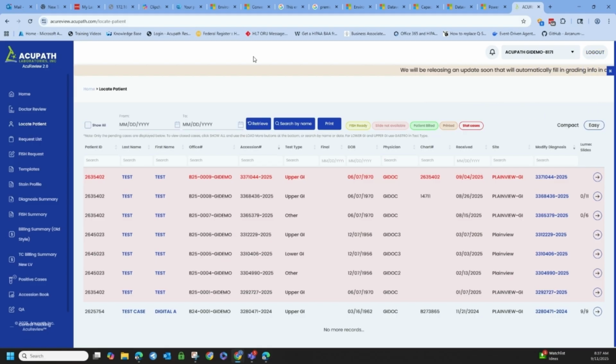Underneath here, scrolling across the bottom, are our notifications. So we have system notifications. If I click on that, it'll pause it. So if you have trouble reading it while it's scrolling, you could pause it and then read it, and then you can click again to play. So that's any system notifications or alerts that we want you to know about, scrolling across the top of the screen.